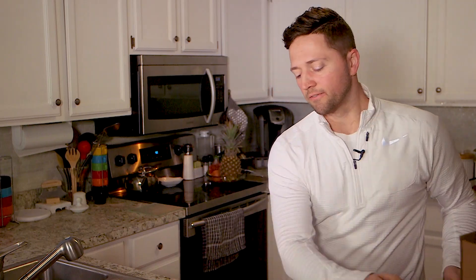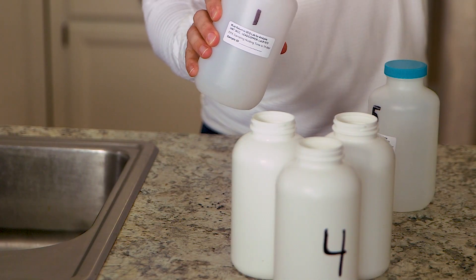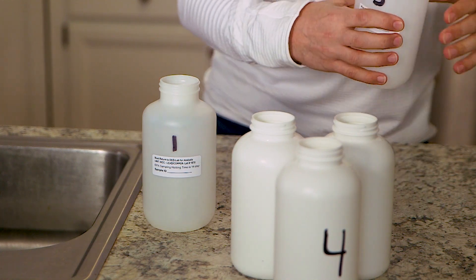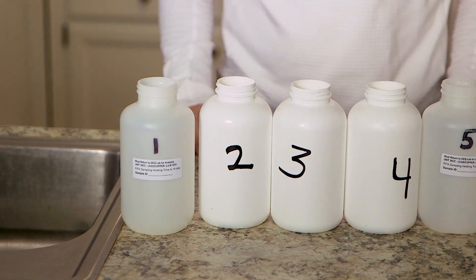To prepare for sampling, first remove the forms from the bottles and place them away from the sink so they don't get wet. Next, remove the caps from the bottles, being careful not to touch the inside of the cap or the inside of the bottle. Now line up the bottles in order from one to five. Make sure the bottles are next to the sink where it will be easy to reach them.